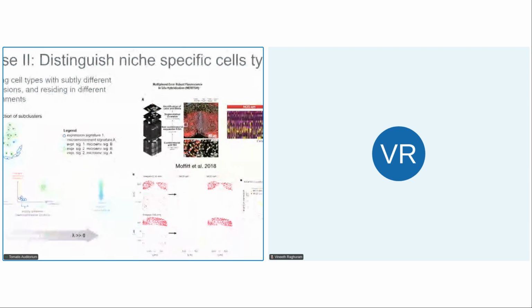And you can also plot own expression metagene versus neighborhood expression metagene corresponding to these genes. And you can see that the situation that we showed in the schematic in our hypothesis does show up, where you have the sparse oligodendrocytes, the gray matter oligodendrocytes, versus the dense oligodendrocytes, even though in the own expression axis they're highly overlapping and therefore very difficult to distinguish via non-spatial clustering. Using Banksy, they're much better separated in this joint space, and therefore Banksy is able to separate them out.